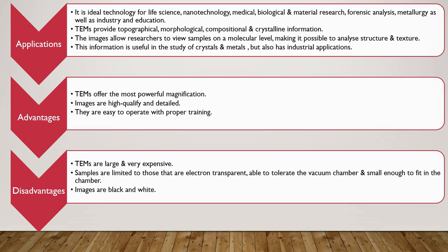Technology companies use TEMs to identify flaws, fractures and damages to micro-sized objects. This data can help fix problems and help to make a more durable, efficient product. Colleges and universities can utilize TEMs for research and studies. Although the electron microscopes require specialized training, students can assist professors and learn TEM techniques. Students will have the opportunity to observe a nano-sized world in incredible depth and detail.